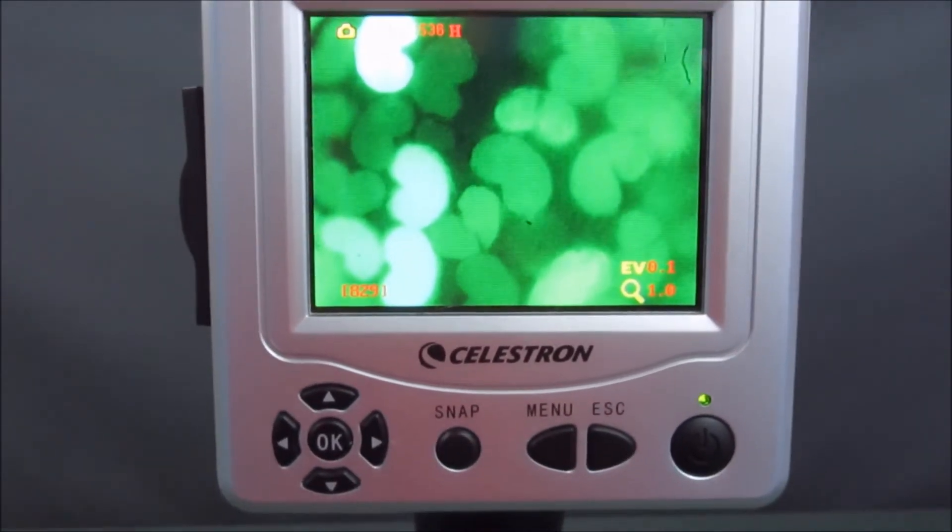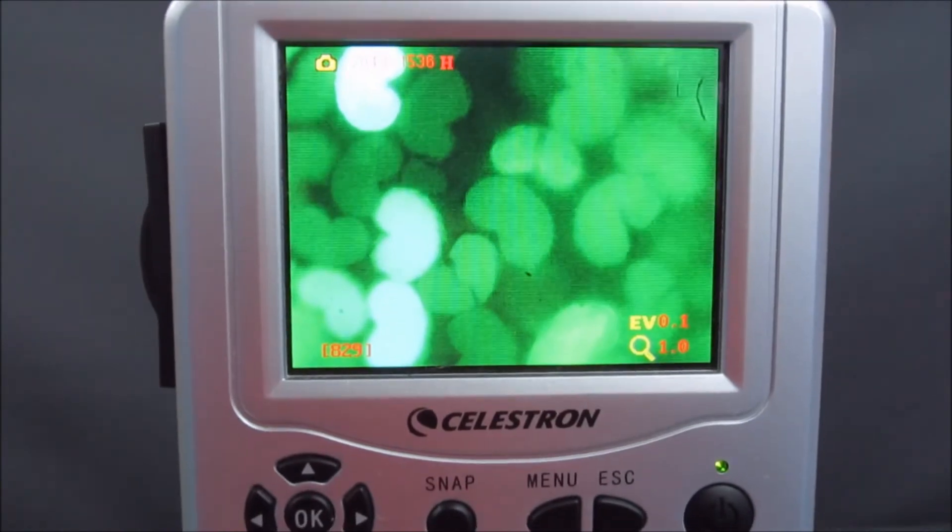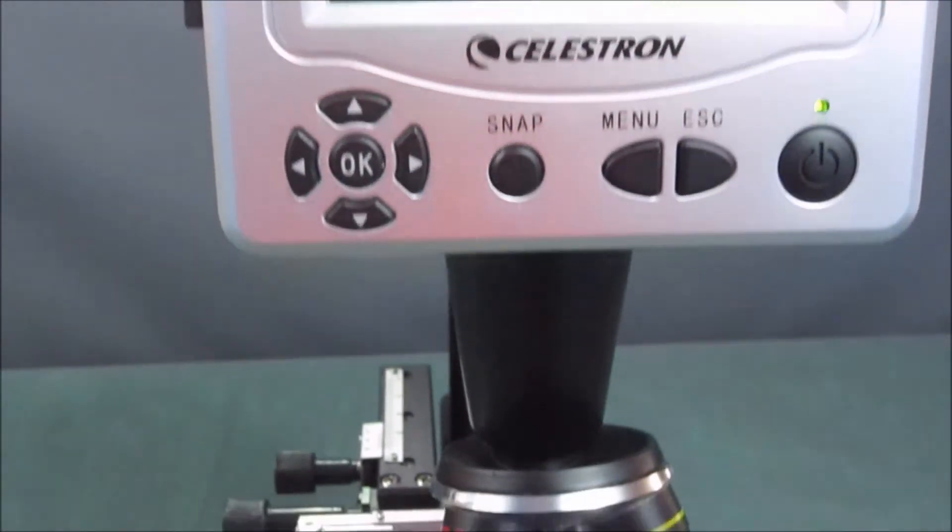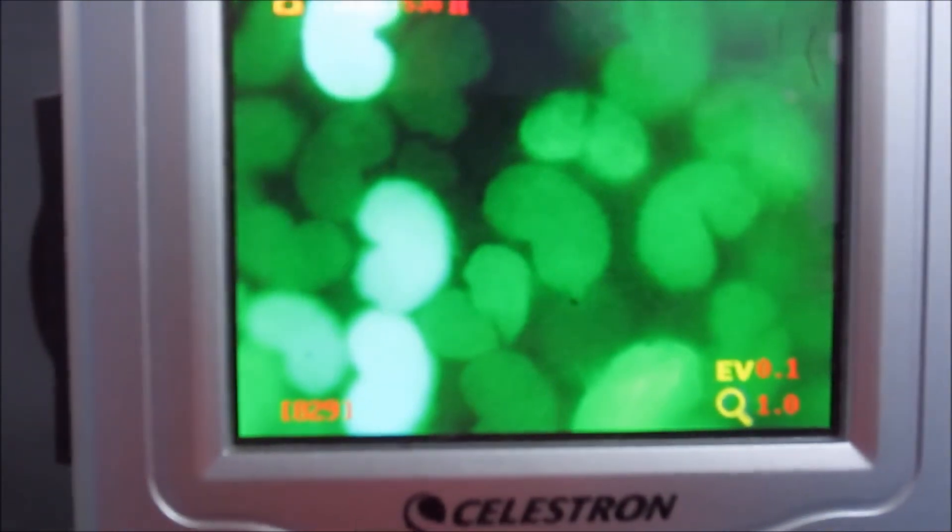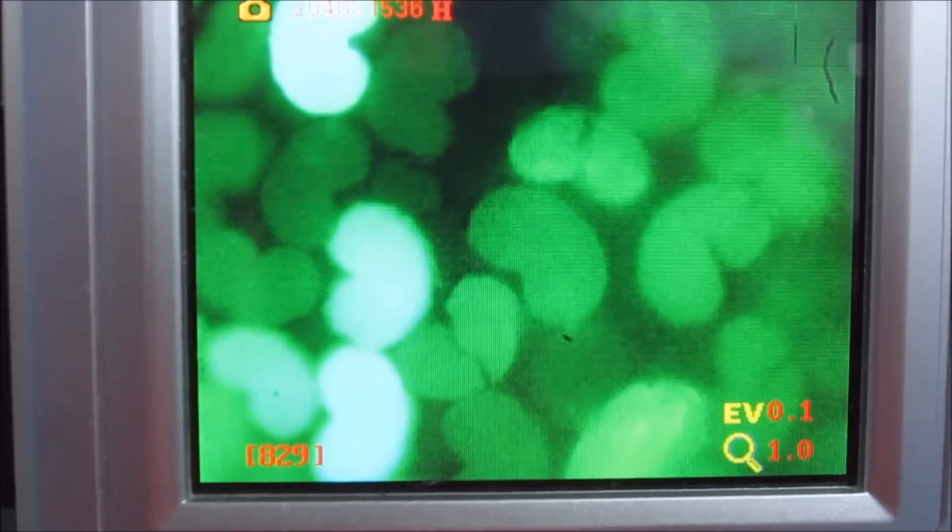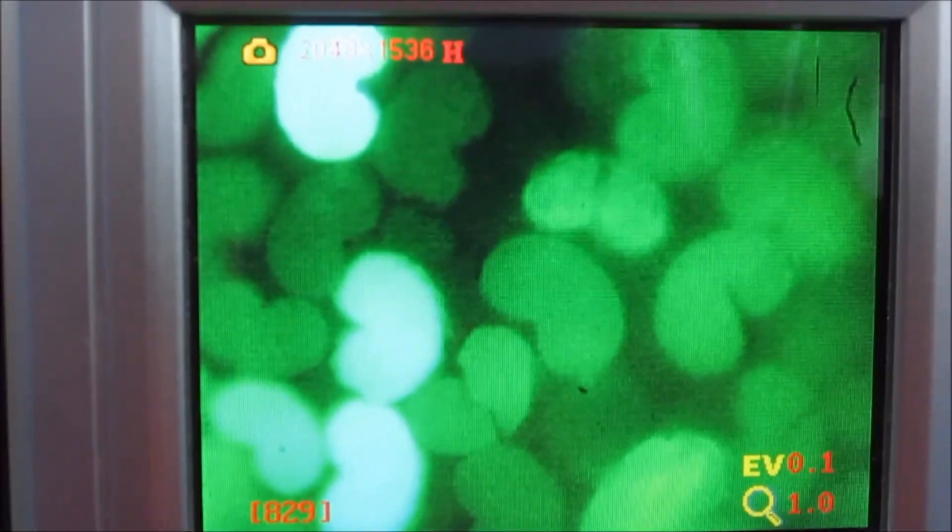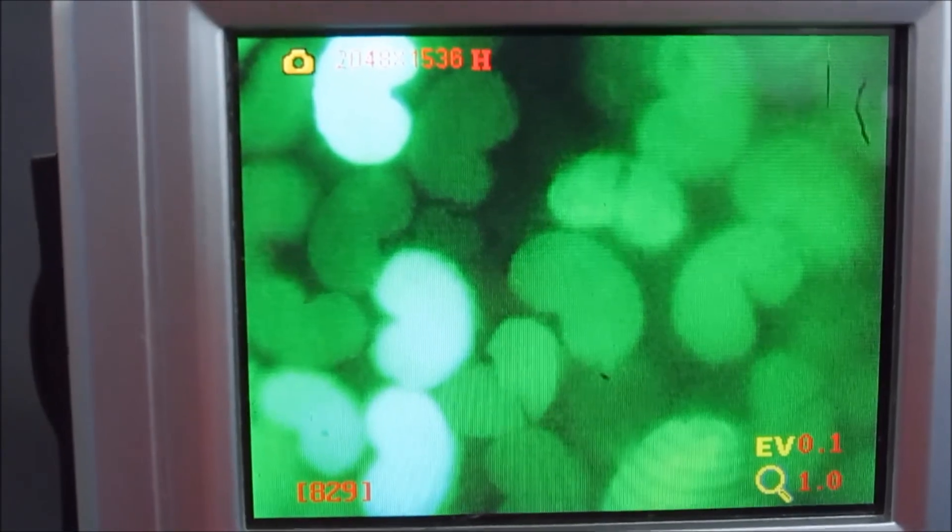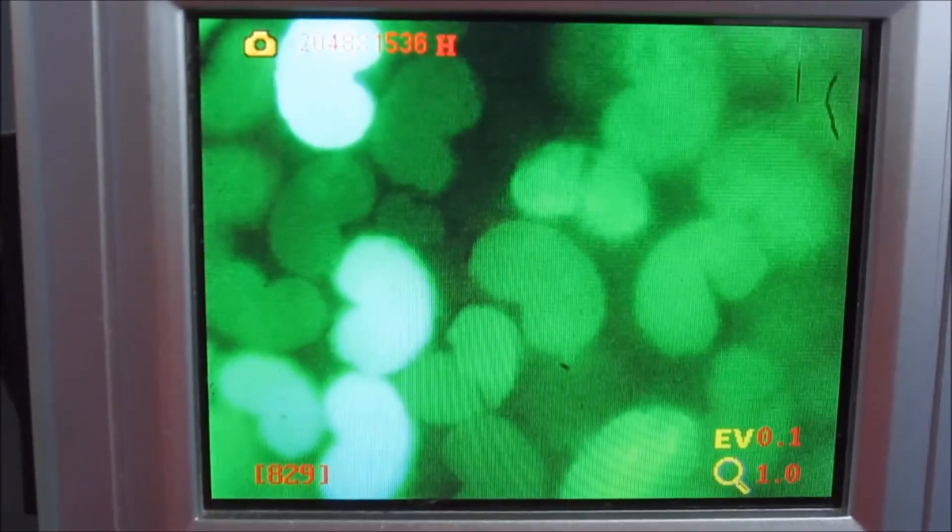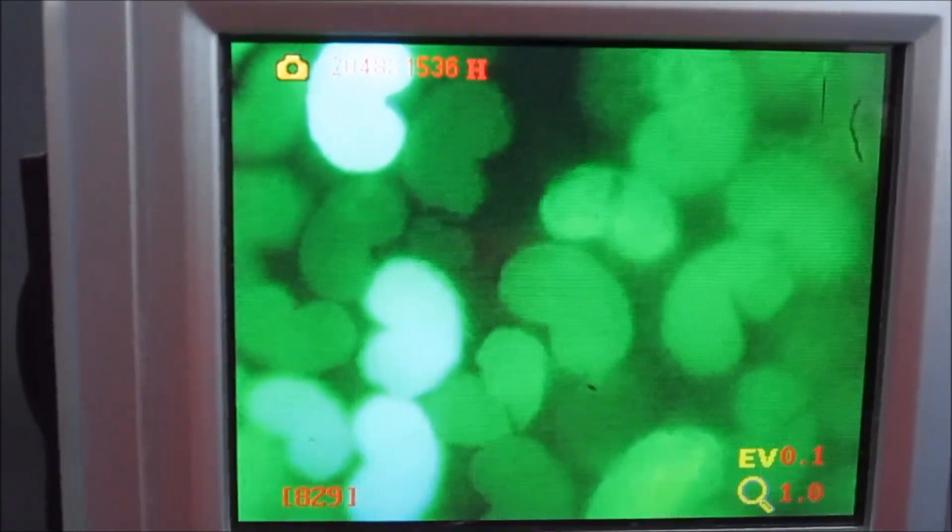Okay, now keep in mind this is an inexpensive scope. People that use these microscope slides usually have something much better than this. There's the plate. That's 1600 times now. It would look a lot better if I had light coming through the top lens. I do not have that. I don't have any light from the top at all. This light here is from the bottom. So it would be much better if I had light from the top. It's very limited to what I can show you on this scope. I hope that helped. Thank you.